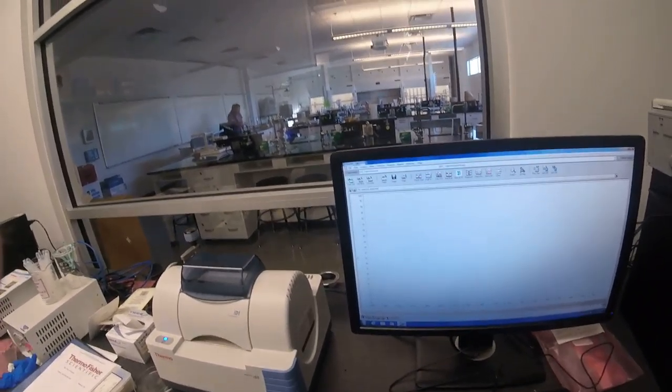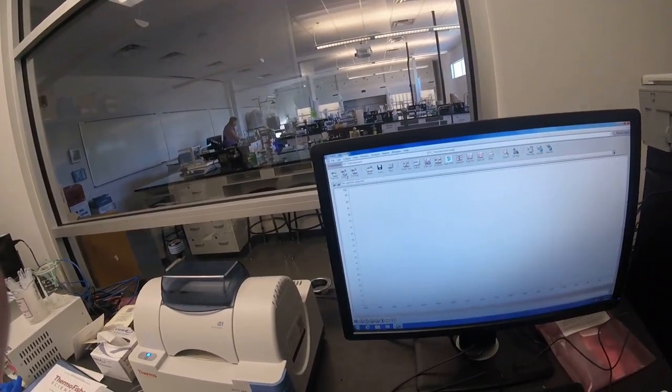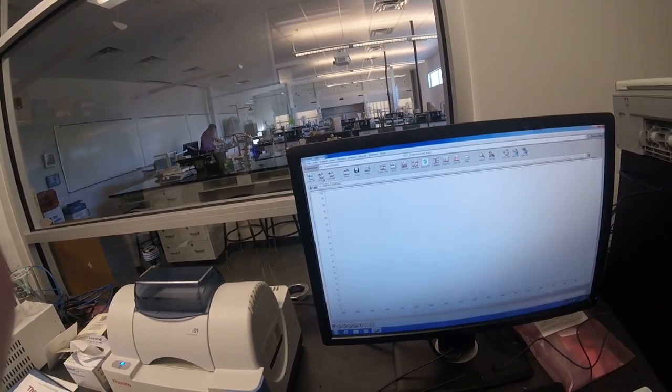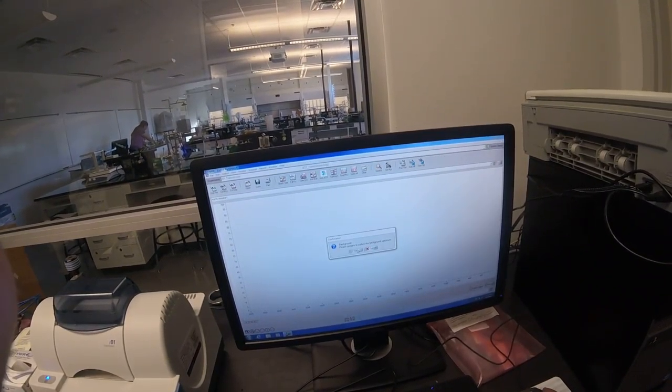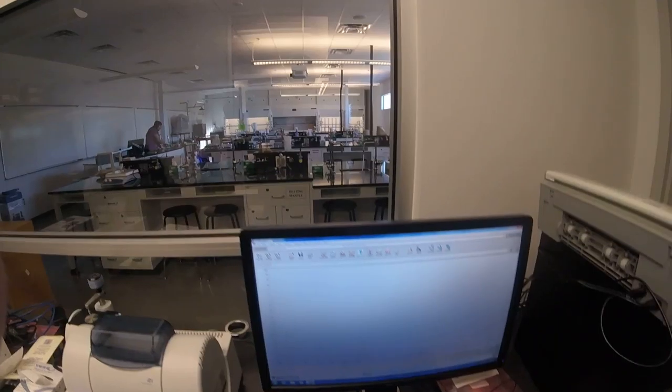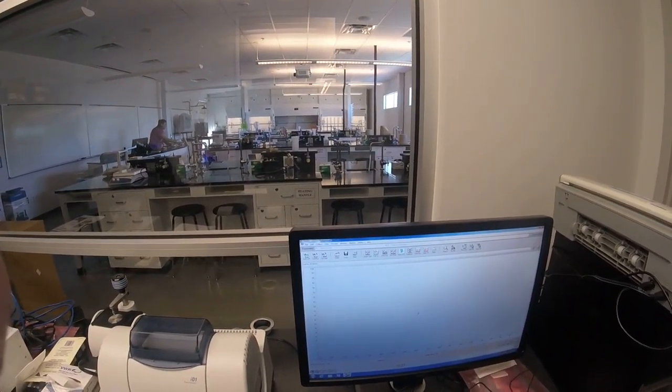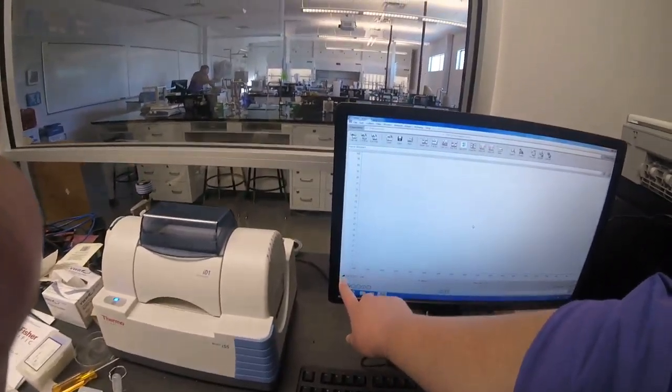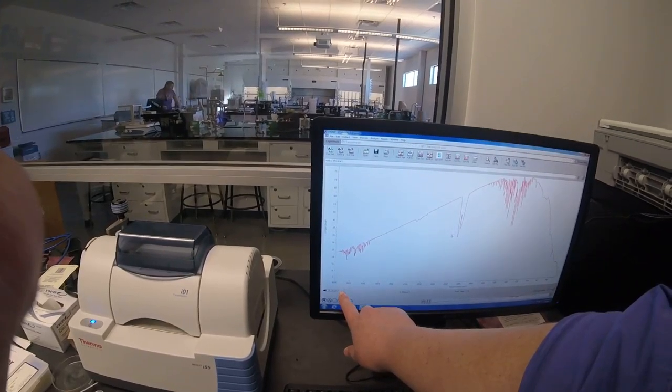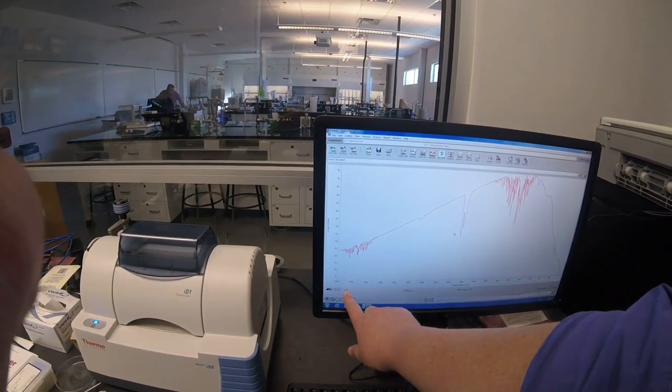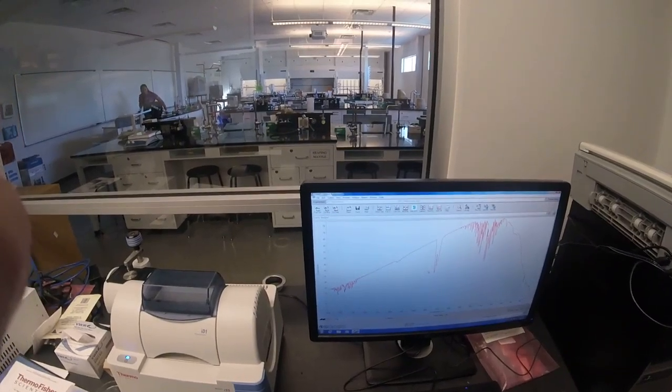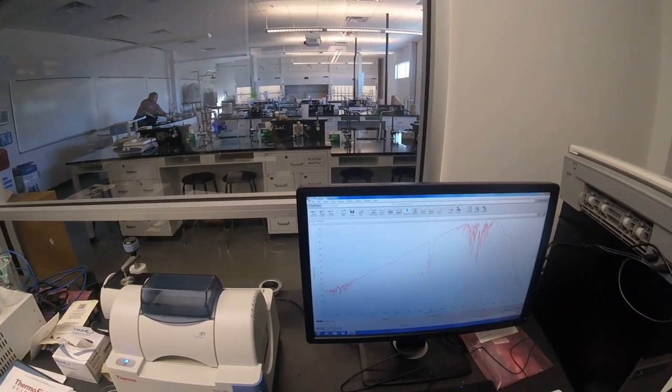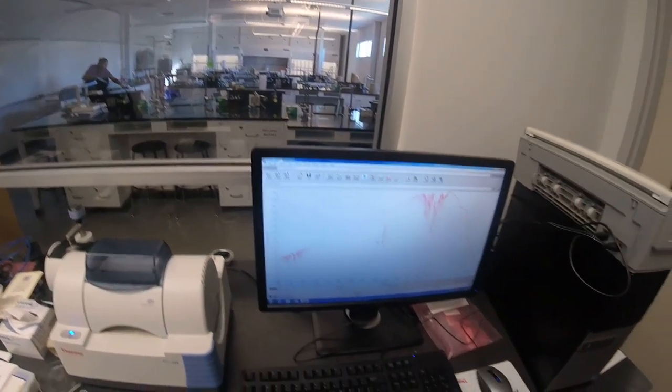To collect the background sample, you can hit collect background, which is pretty cool. And then it says please prepare to collect the background spectrum, and you say okay. Now, this bottom part right here is where it's saying how many scans it's doing, and we have it set to do 16 scans. So you have to wait for that to be done before you do anything else.